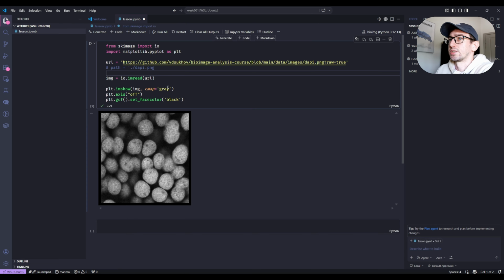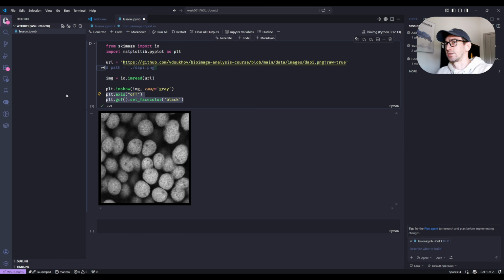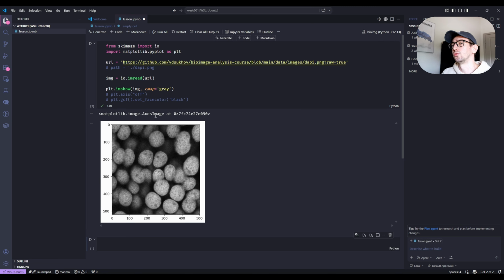And here, using the plt functionality, we use imshow. Basically, it stands for image show. We use cmap gray, and to be honest, this can be excluded. I just added it to have better visualization in terms of how it looks on the website. But this part is not very crucial for us. You can remove it, and in this case you have the axes for X and Y, and the background is white. But the idea is basically the same. We just represented our image.